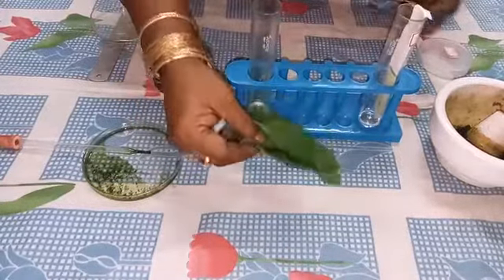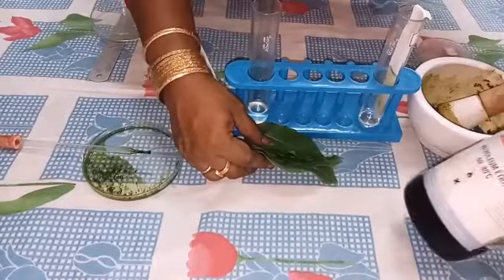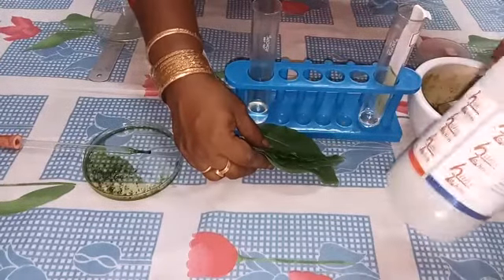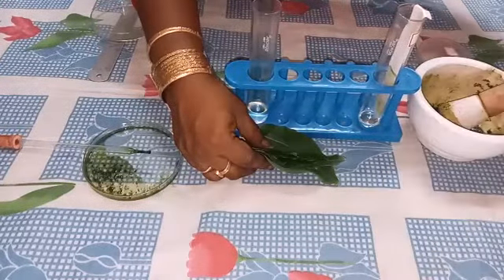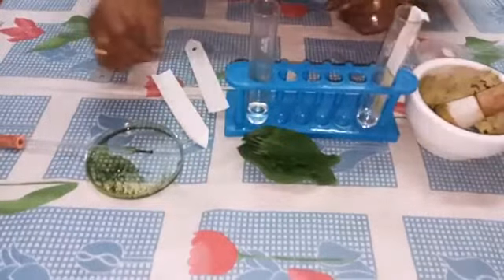For that we need a leaf, mortar, petroleum ether, acetone, and a test tube.